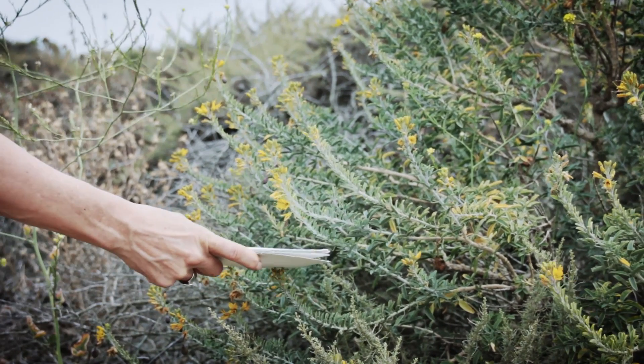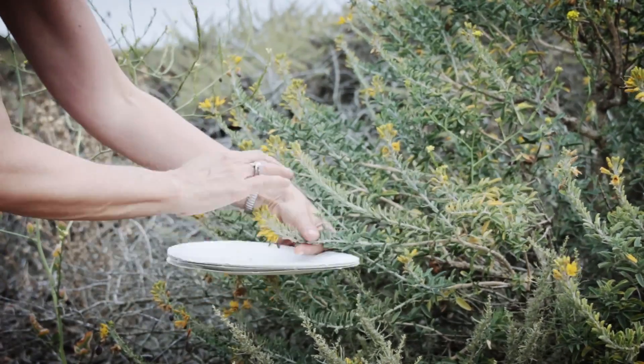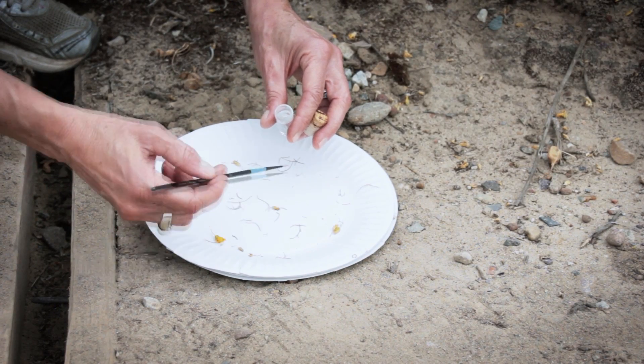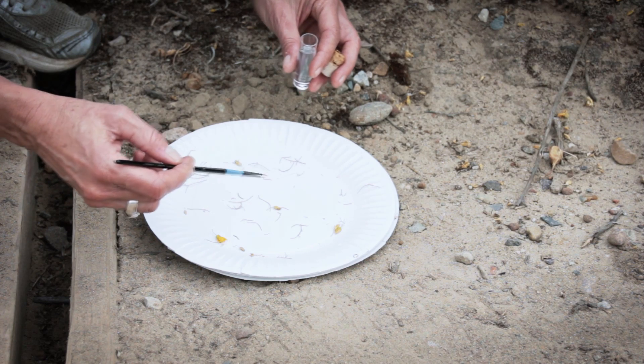For smaller creatures, tap a flower over a white tray, white paper plate, or white pad of paper to find thrips, spiders, and other species. Once you see a tiny insect, use your paint brush dipped in alcohol to capture it and get it into the vial of alcohol.